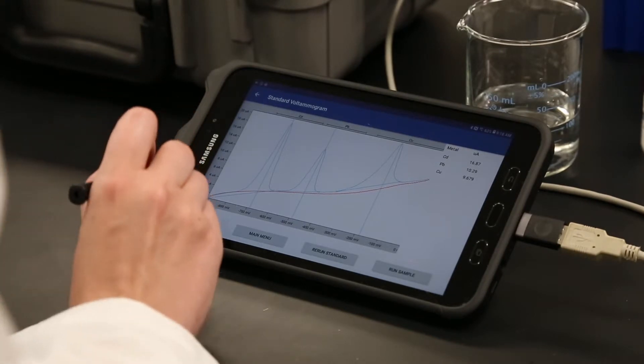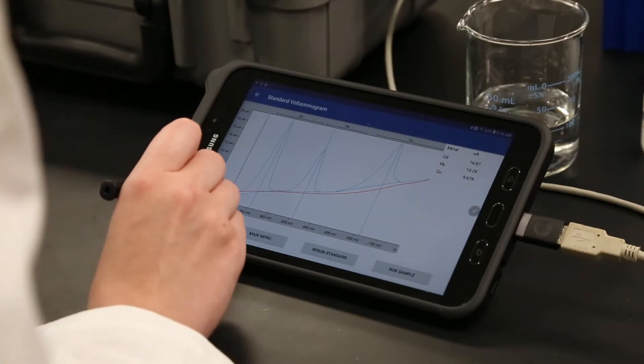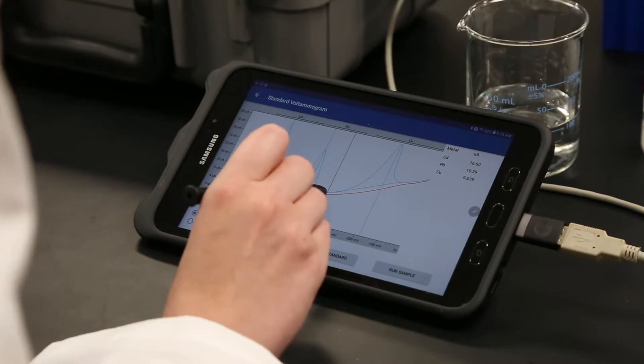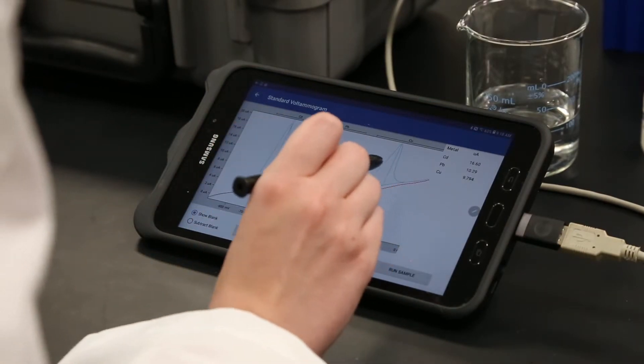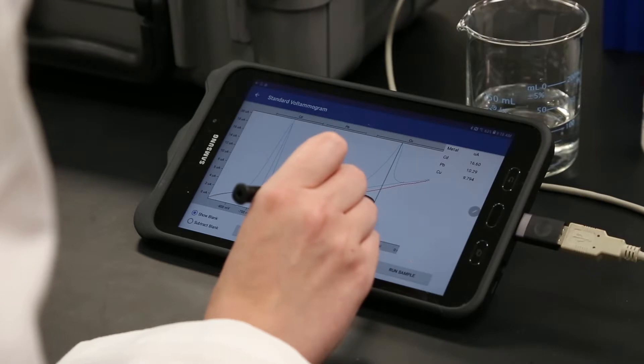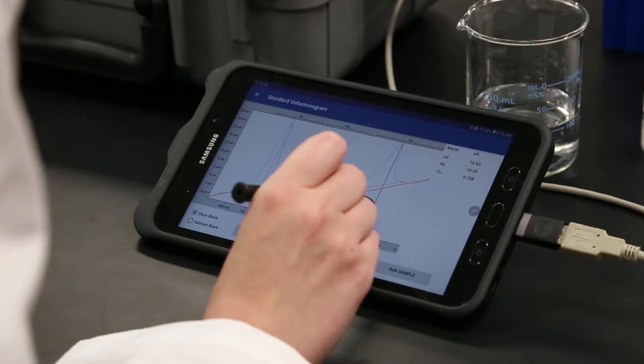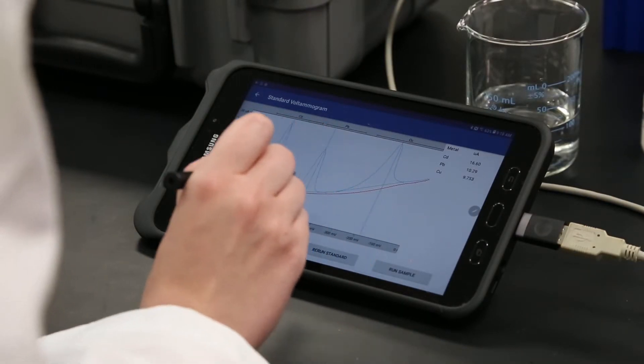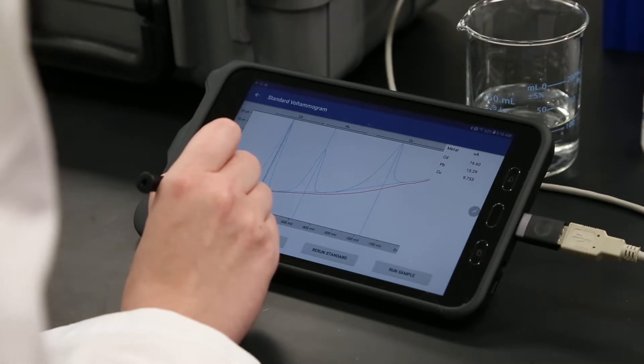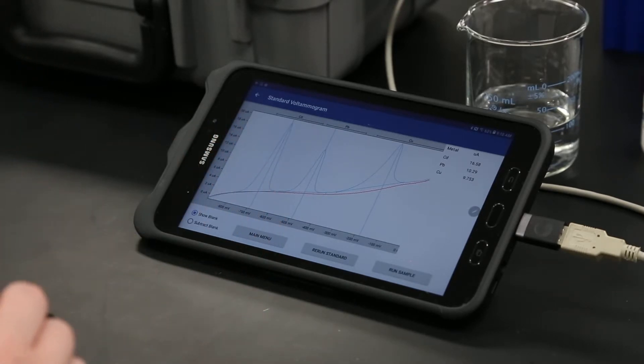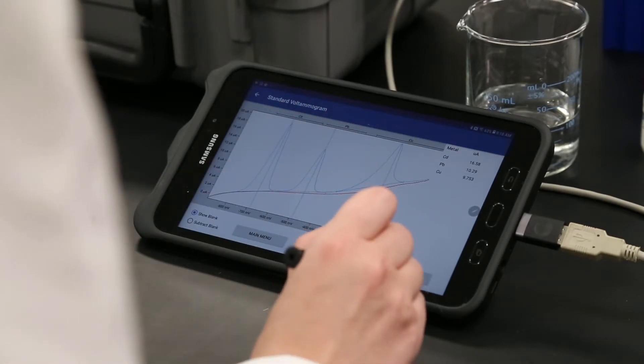At this point, the user has the option to adjust the metal window, peak center, and baseline by dragging them to the desired voltage. This is not usually necessary, but if it is not done at this time, there is no option to do it later and any changes will require analyzing another standard. Once a satisfactory standard is seen, click Run Sample to continue the analysis cycle.